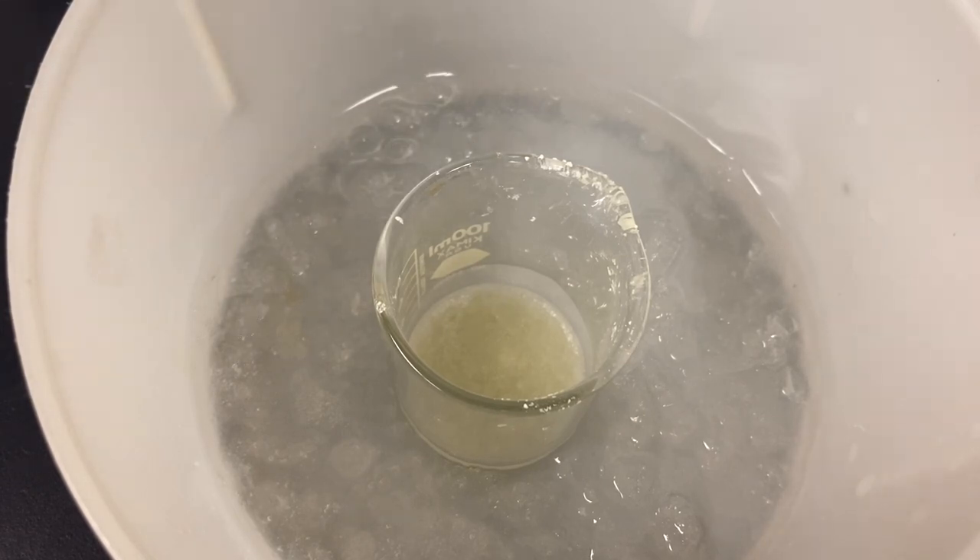So now that it has cooled down to room temperature, I went ahead and put our mixture in an ice bath just to help get any more out of the ethanol.